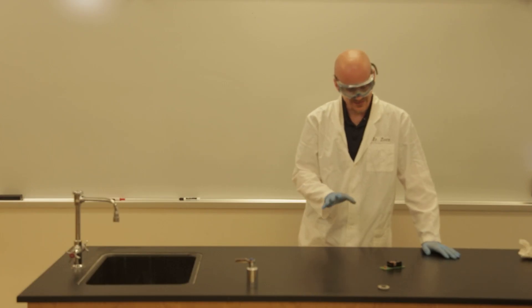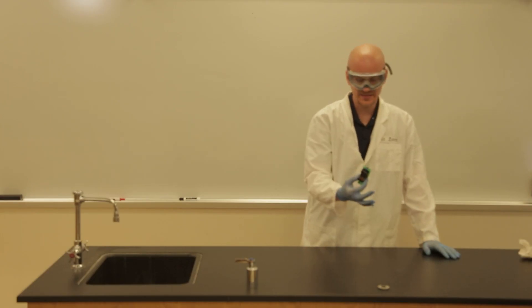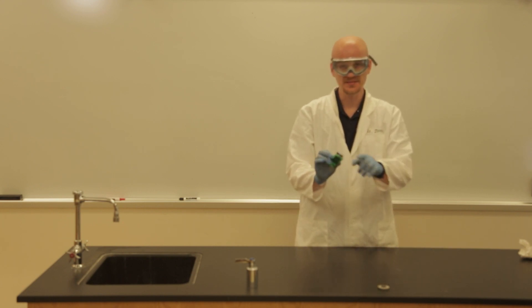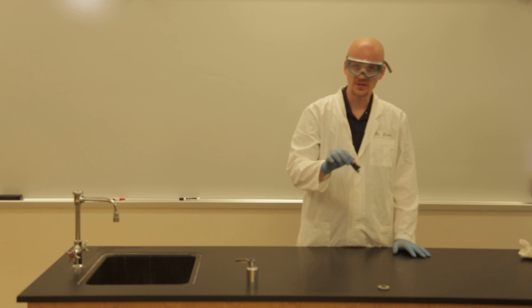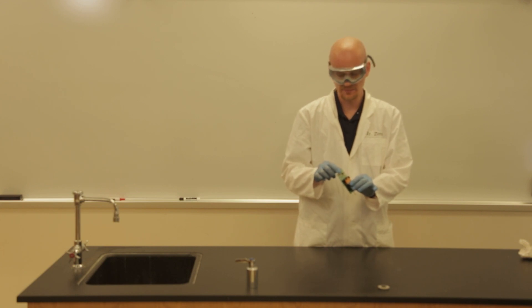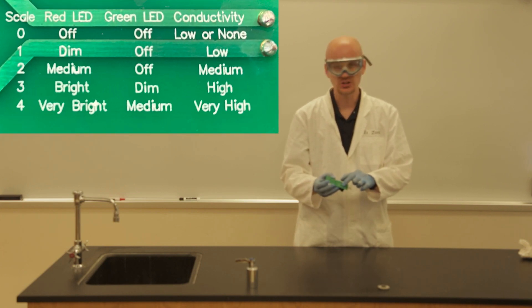All right, next we're going to test conductivity. So I have a conductivity probe here. There are two metal pieces sticking out and you want to make sure that your sample touches both ends of the conductivity probe here. Okay, there are some lights here on mine and then on the back there's a chart.